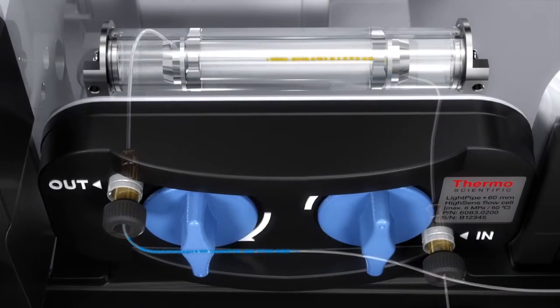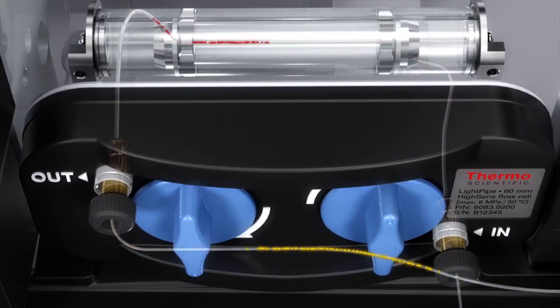200Hz data collection will keep up with even the fastest UHPLC separations.